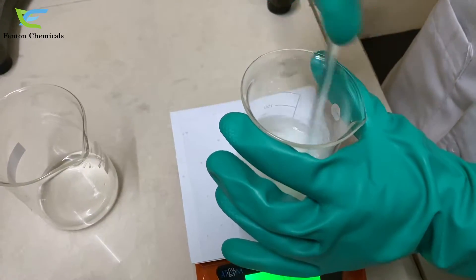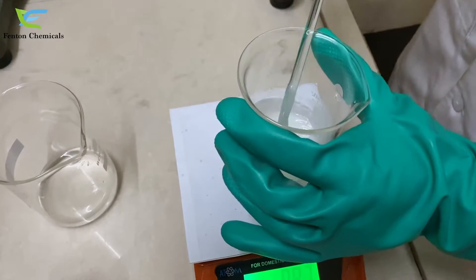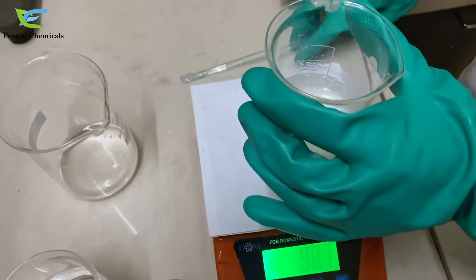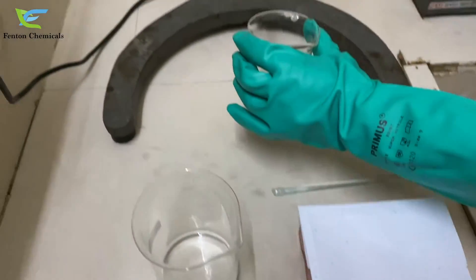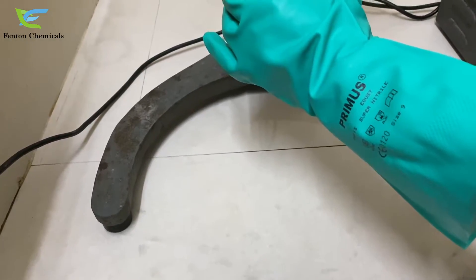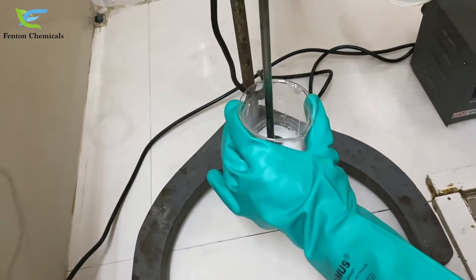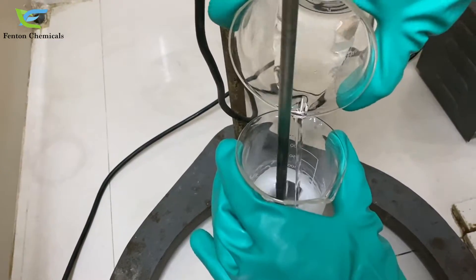You need to have at least a stirrer of 2000 rpm. Now we will take this to our stirrer to mix it properly, and slowly we will be adding water to it.